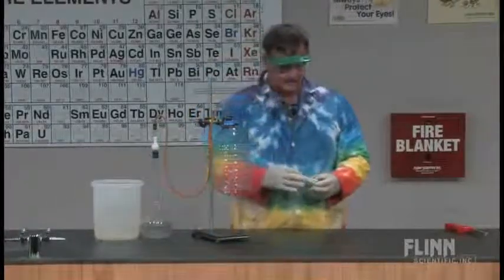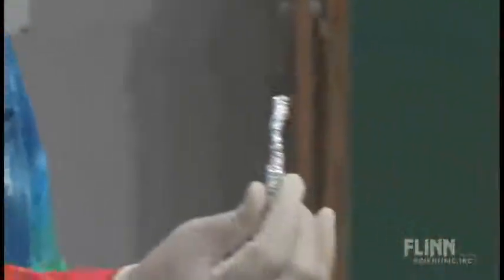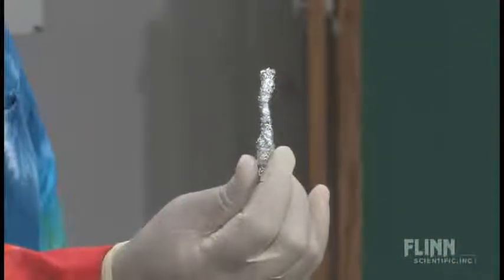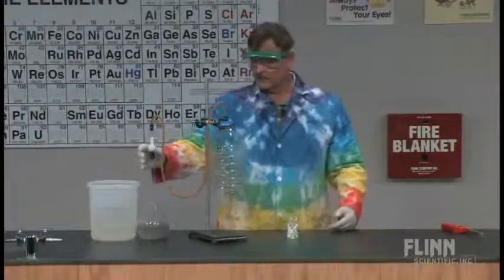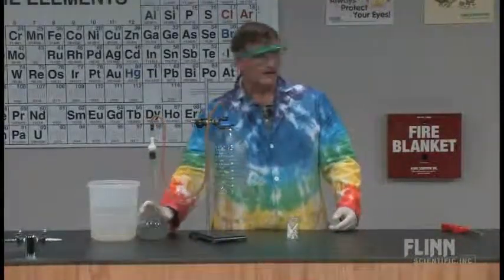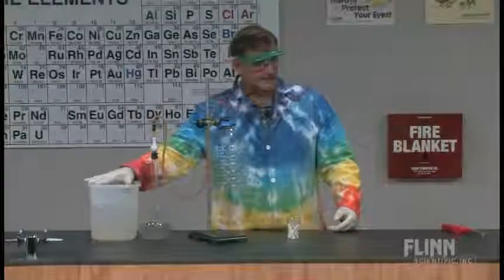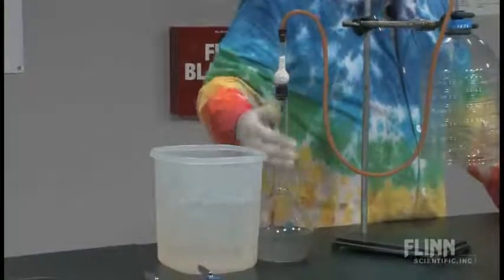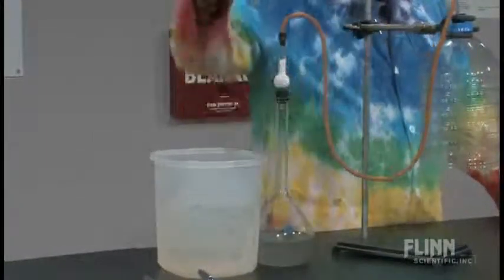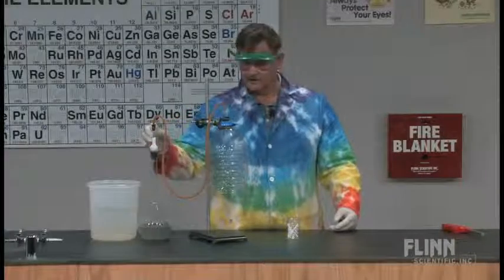I just take aluminum foil and tear it up, then twist it into little strips, and drop those down into my volumetric flask. You want to use a volumetric flask because this gets very hot — it's very exothermic. I have an ice bucket right next to it, so if it starts to look like it's bubbling up into the neck of the flask, I'll immediately put it right in the ice water to cool it down.